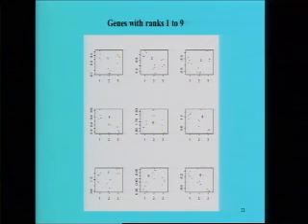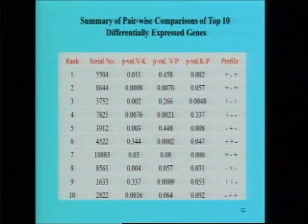So these strip charts and p-values of the pairwise test help us to assign the profile for each of these differentially expressed genes. If you look at this rank 1 gene, the p-value for Vata and Kapha prakruti is 0.011, which indicates that it doesn't have the same profile in Vata and Kapha prakruti. The p-value for Vata and Pitta prakruti is 0.458, indicating that the hypothesis of equality of average gene expression under Vata and Pitta prakruti may hold. The p-value for Kapha and Pitta prakruti is again 0.002. It indicates that the average expression of this gene in Kapha and Pitta prakruti may be different.